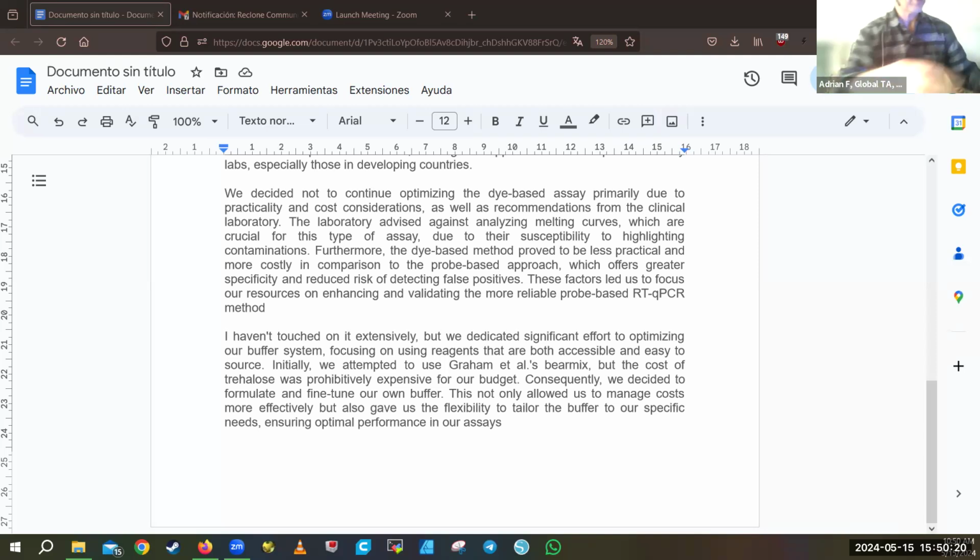Yeah, sorry. So this is the transilluminator, and it's a dedicated PCB board with some LEDs. Do you mind if you stop sharing screen so we can see more of what Adrian is sharing? Okay.